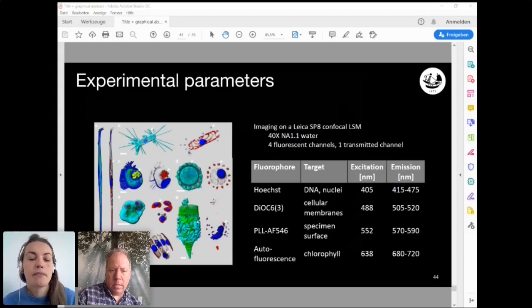Okay. I think she mentions, can you do bacteria and zooplankton? I guess bacteria can be smaller. Zooplankton is starting to get bigger already. I'm not sure you would need the resolution of a confocal for that. It depends on what exactly she's interested in looking at. Maybe send me an email if you want to discuss it in more detail.